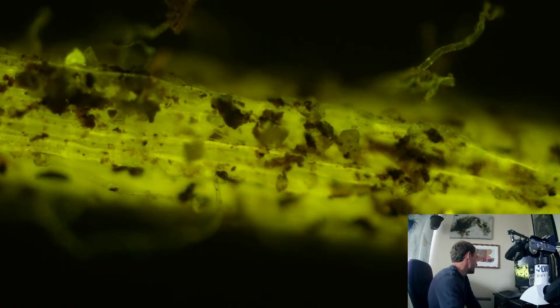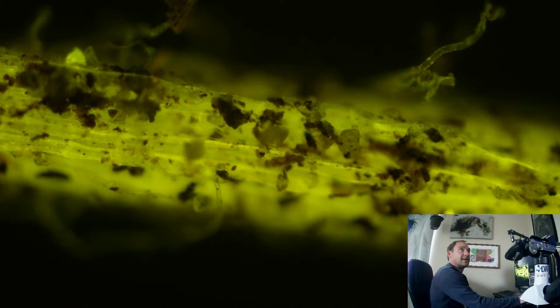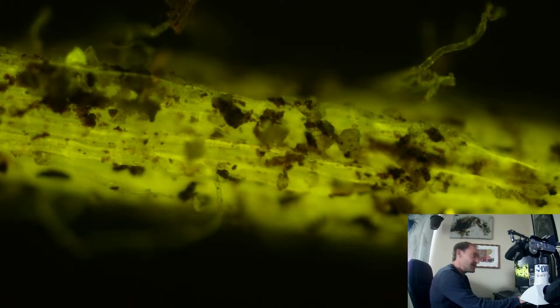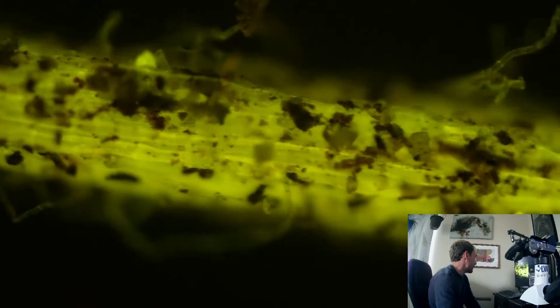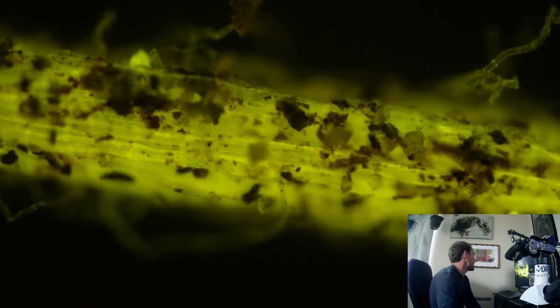So you can see all that, the veins there glowing, because that's all the spaces between the cells of the plant. And that's glowing quite a bit. Probably up top there on the root is a little piece of phosphorus.